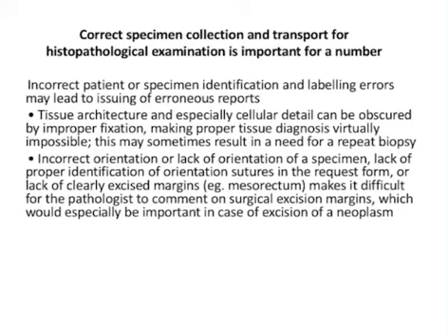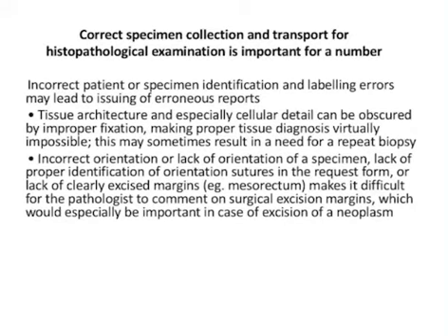Incorrect orientation or lack of orientation of a specimen, and lack of proper identification, can be problematic. For example, if there is no margin indicated, we cannot do proper gross sectioning and we can miss out on the part of the tissue we need to diagnose. Correct sample collection is absolutely necessary. If we neglect collection steps, we will compromise our tissue diagnosis.